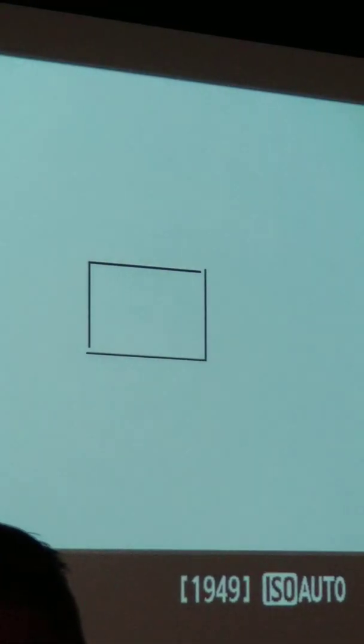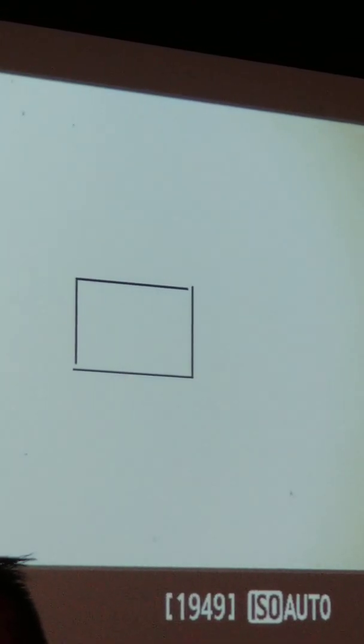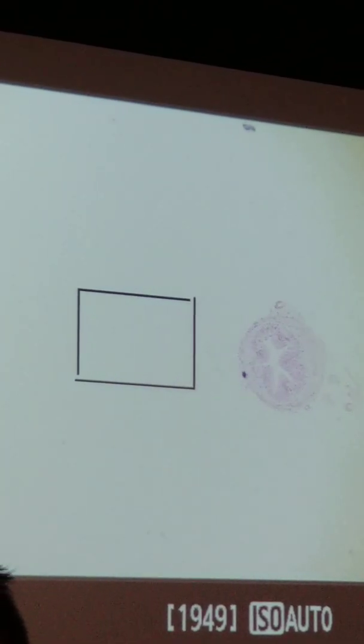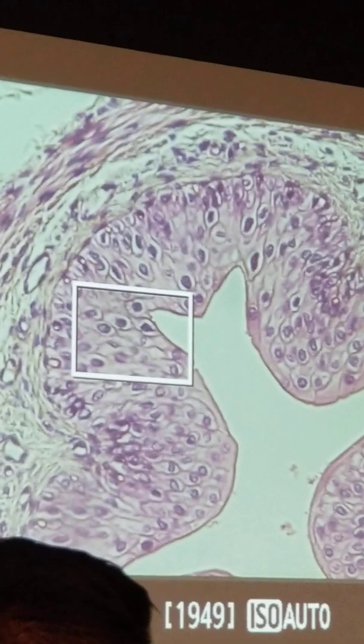And that's going to be the transitional epithelium. It's always kind of hard to find because it's a little bitty dot on the slide. There it is, right there. I didn't find it earlier today. This one's really light too. Okay, so that's about as good as I can focus it there. Go to 10. Okay, and go to 40. Okay, and now we can see it at 40.